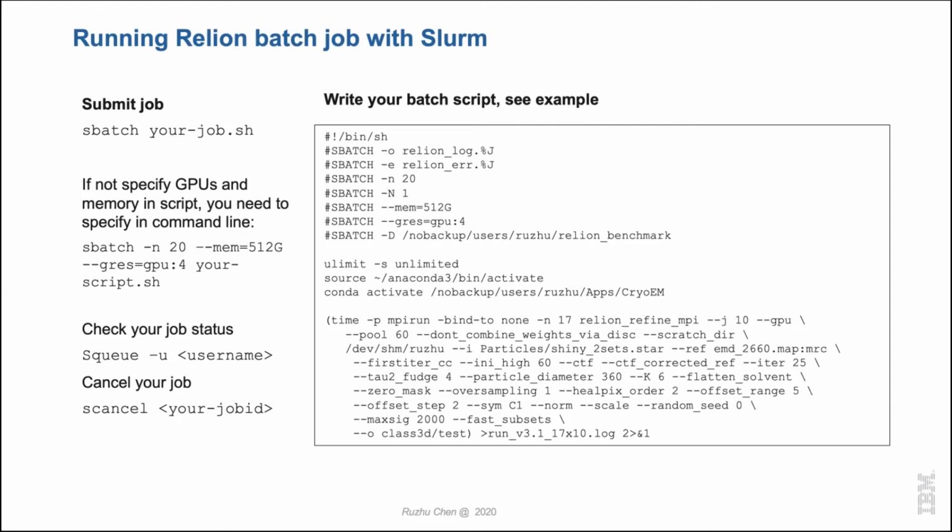But for us, in terms of performance, getting better performance is our goal. That's why we recommend these two parameters here. So any questions about the parameter setting here?